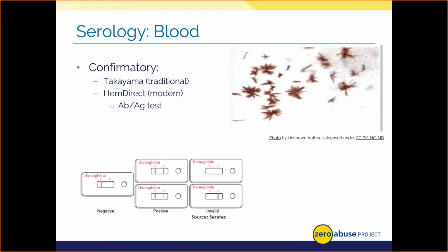Generally, by and large, laboratories have moved away from this confirmatory test for a few important reasons. Number one, Takayama chemicals are carcinogenic. They are cancer causing, and it's just too dangerous to continue asking a lab analyst to use this method when other safer alternatives exist. Now, we used to have to confirm that blood was human beyond the Takayama test.